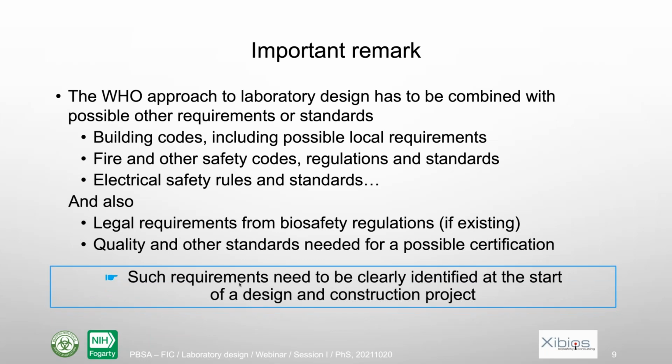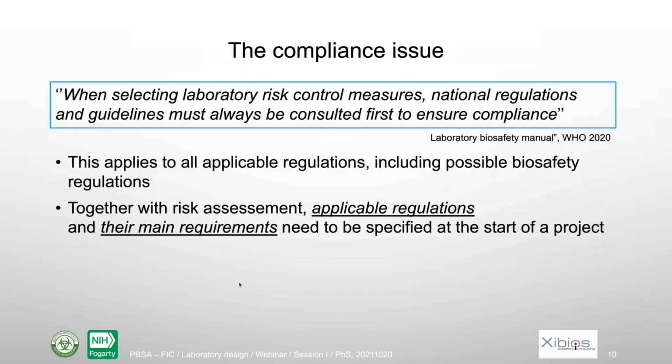And all those requirements should be clearly identified at the start of a project. That's something which is very important. So this has to deal with legal compliance, and WHO clearly says that you need to take care of that also. So you need to add that to the operational needs and biosafety needs.